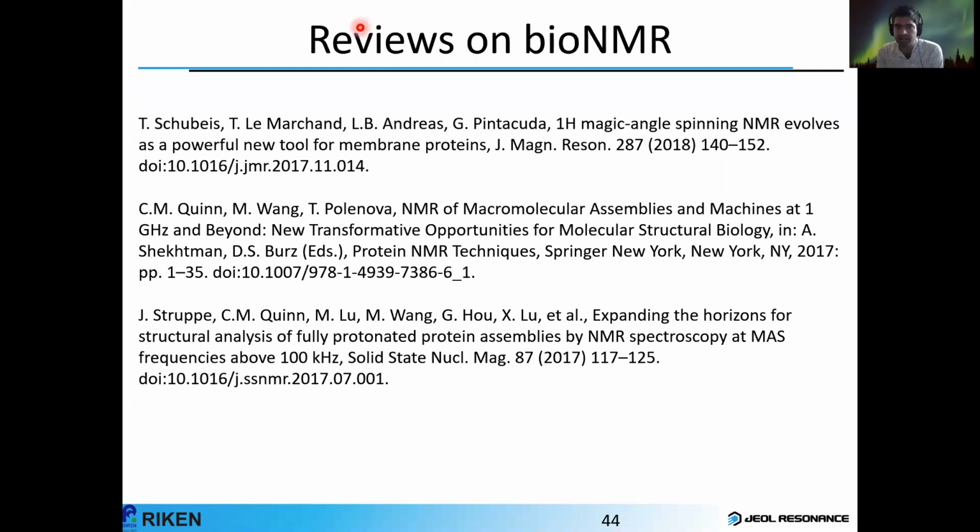Okay, all right. So the next question is from another anonymous attendee. How many protons were used to numerically simulate the PDSD simulations? And in general, minimum, how many of them would be required to mimic the experimental results? I think we need 100 protons.